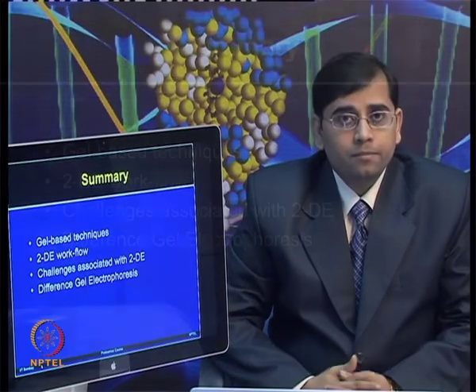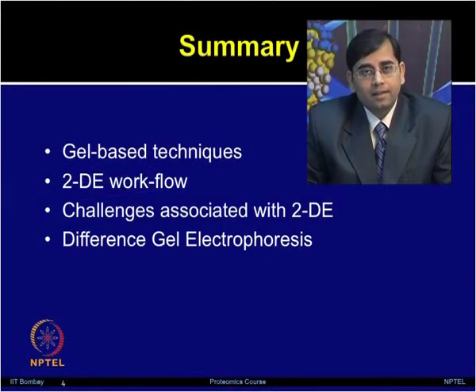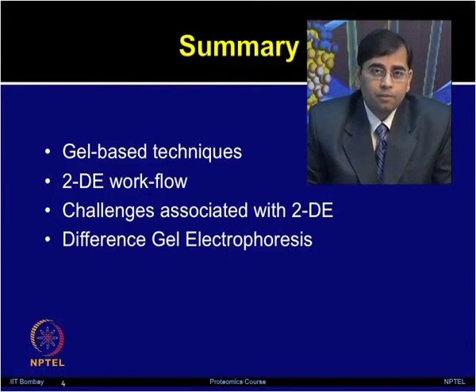So in summary, in this module we have discussed gel based techniques. We talked about basic separation by using SDS PAGE and blue native PAGE, then how to perform isoelectric focusing, and by combining those two methods, how to perform two-dimensional electrophoresis. I gave you a workflow for performing a two-dimensional electrophoresis experiment.